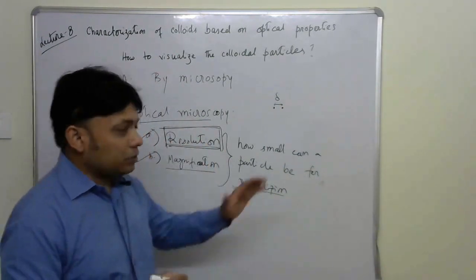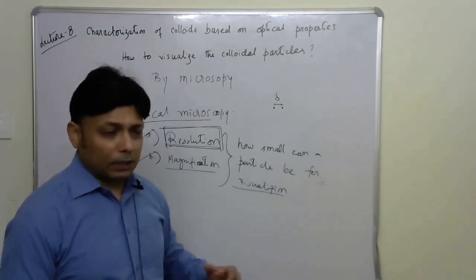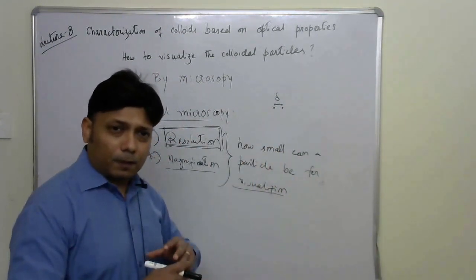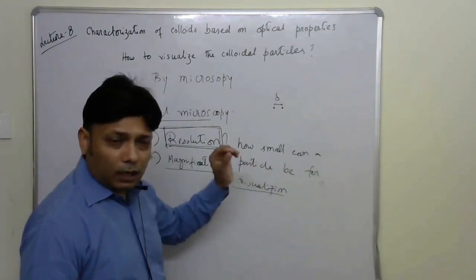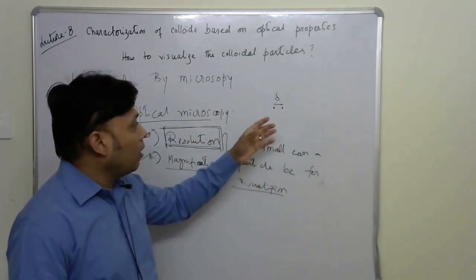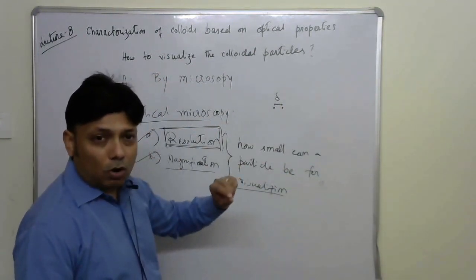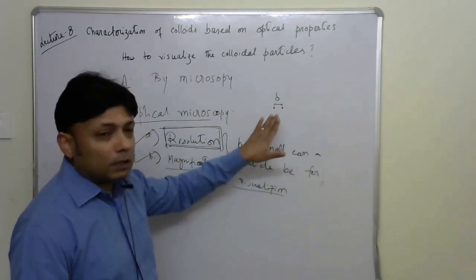Without the resolution, the magnification does not have any meaning, because you can magnify a million times, but the question is, can you extract the important information that you require, or any useful information, from that image? The answer is no, or yes, provided you have the adequate resolution.